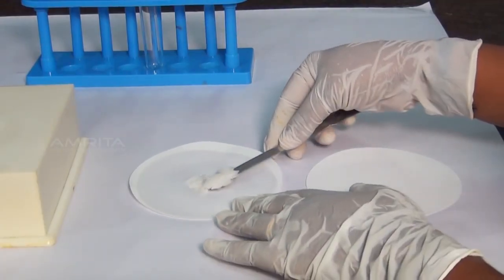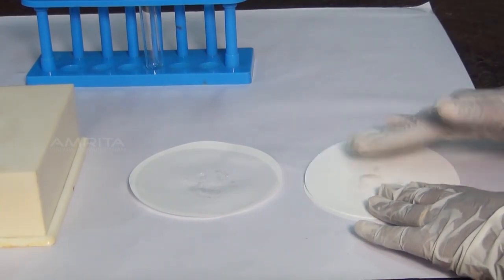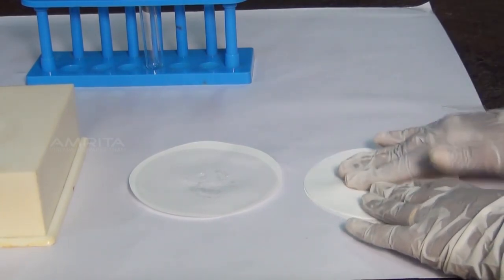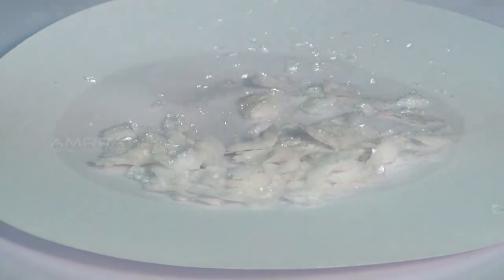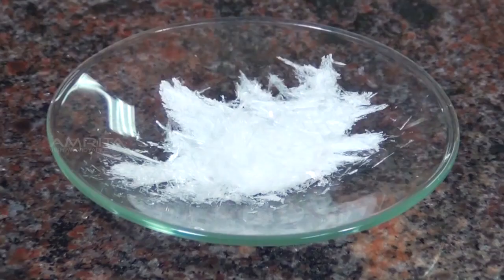Transfer the crystals to another filter paper and dry them by pressing gently between the folds of the filter paper. Transfer the crystals into a dry test tube. The crystals of benzoic acid are opaque white.